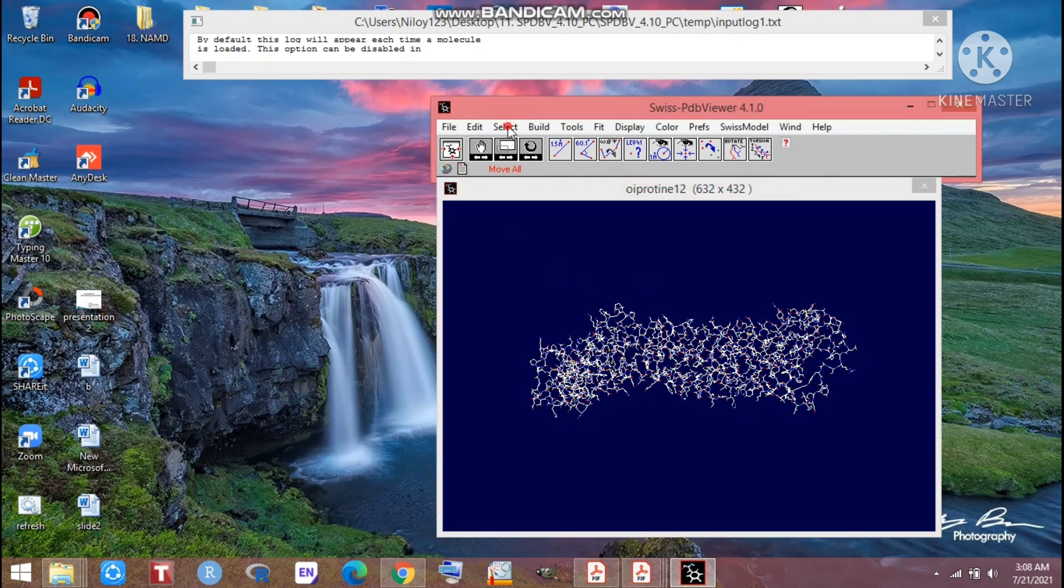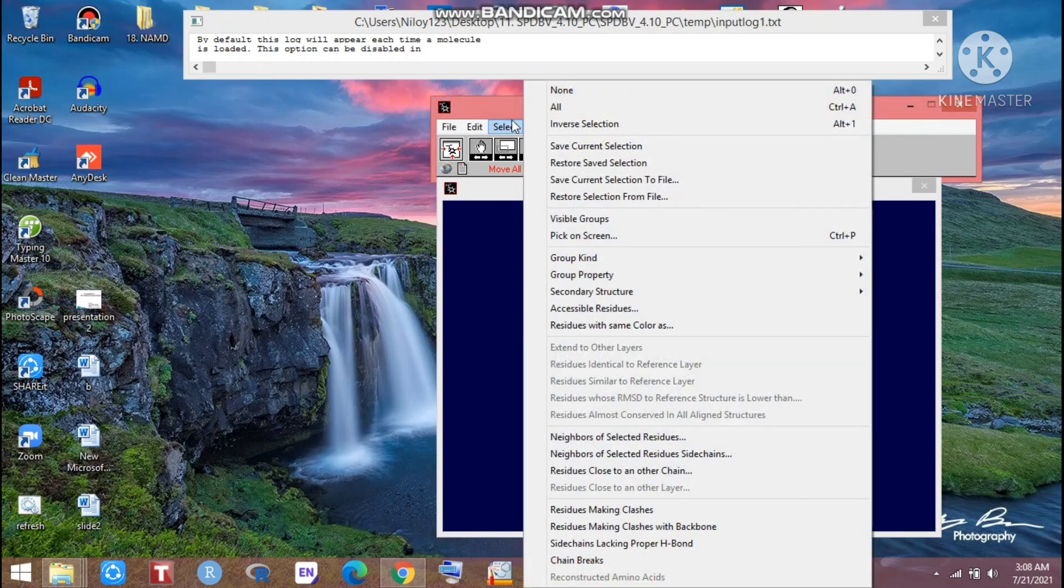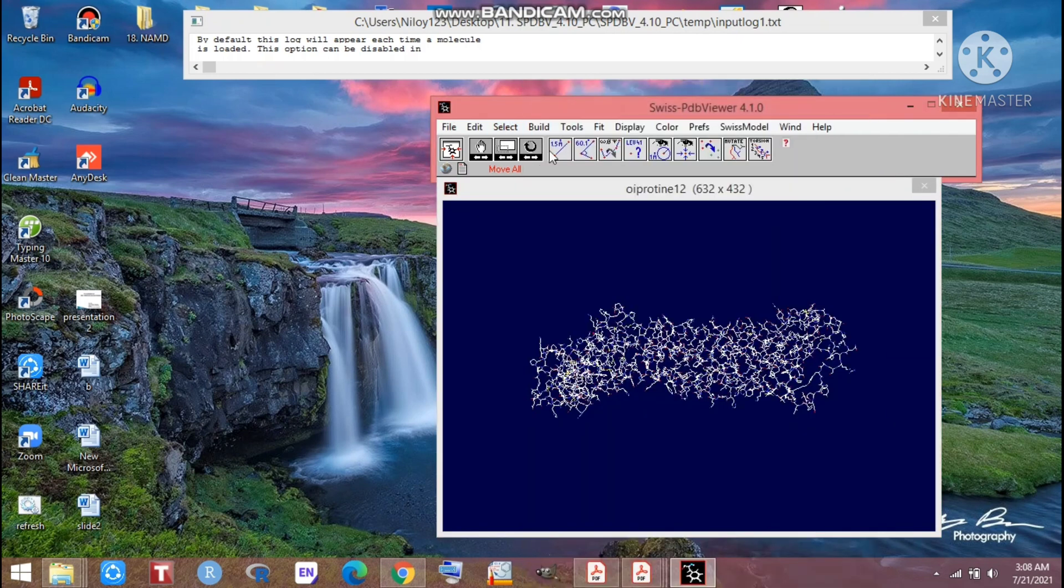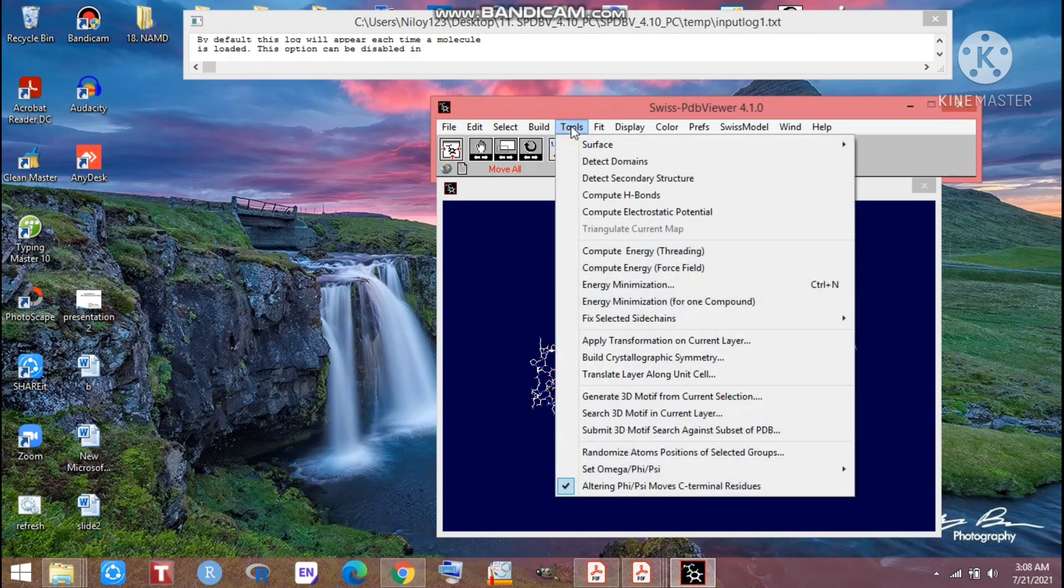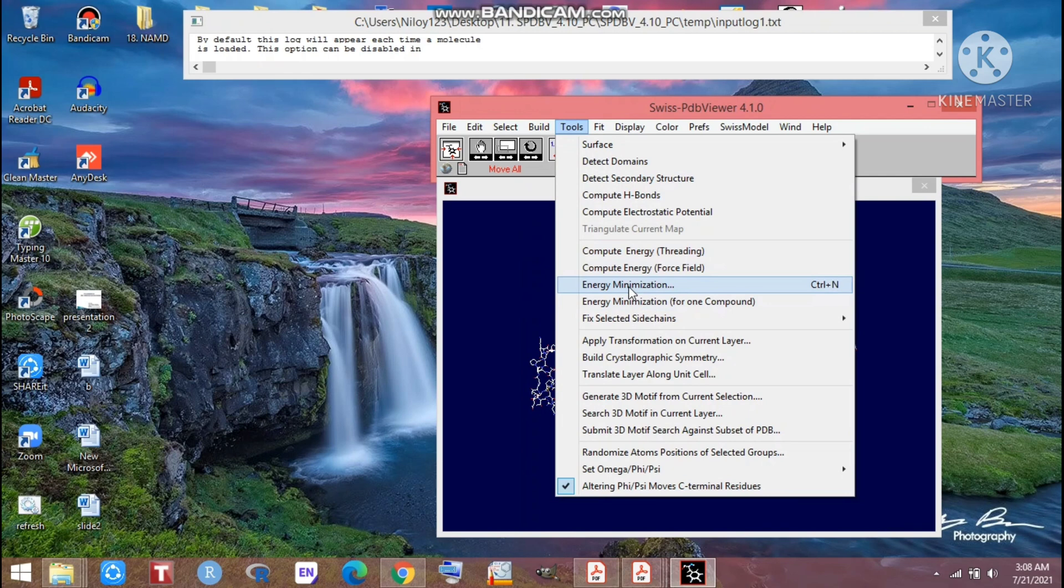First of all we have to go for Select option and we will select all. After selecting all we will go for Tool. After going to the tool you will get these kinds of energy minimization points. Just click on this energy minimization.